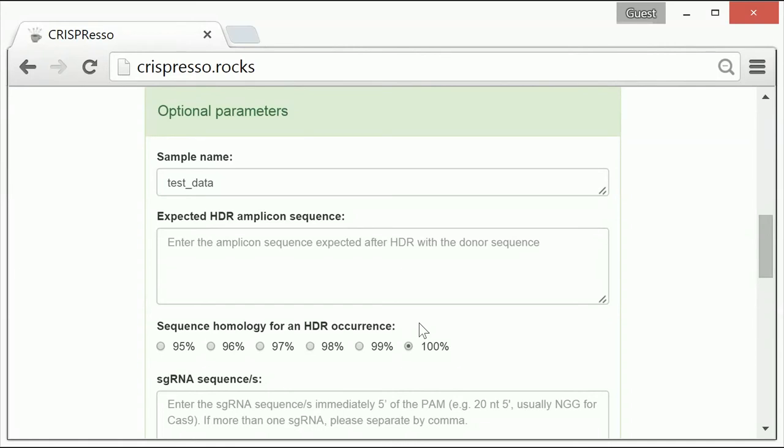We would suggest initially setting this to 100% and then reviewing the data, but then relaxing this parameter as appropriate.